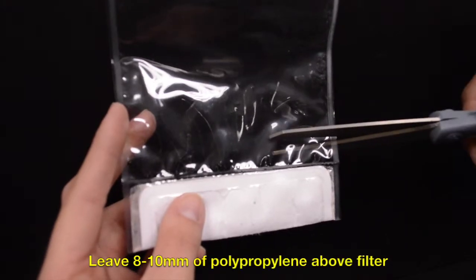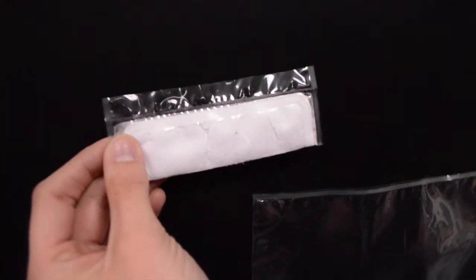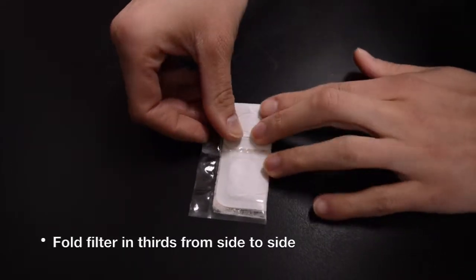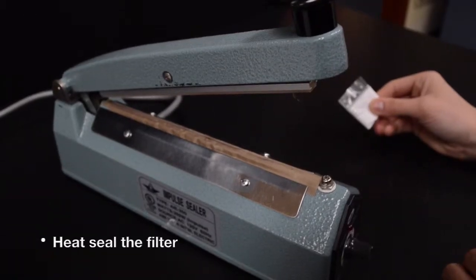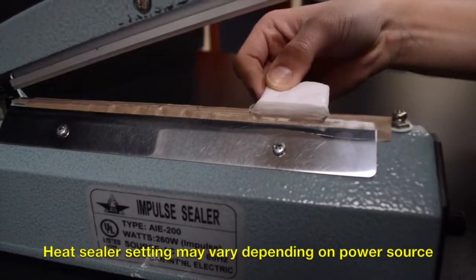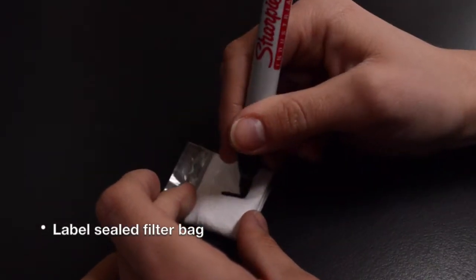Cut the polypropylene of the bag 8 to 10 millimeters above the filter so enough polypropylene is left to be sealed after the filter has been folded. Manipulate the filter to spread the sample out evenly. Fold the filter from side to side so that it fits in your Kjeldahl tube. With your heat sealer set to 6, place the exposed polypropylene material from your final fold onto the heat sealer. Press the arm down. Release the arm three to four seconds after the red light goes off. Re-seal the bag if necessary. Label the folded sealed filter bag.